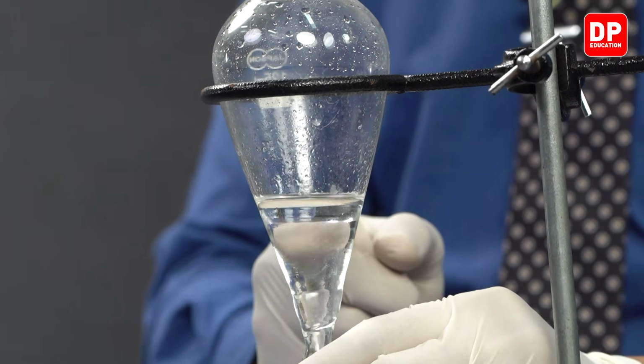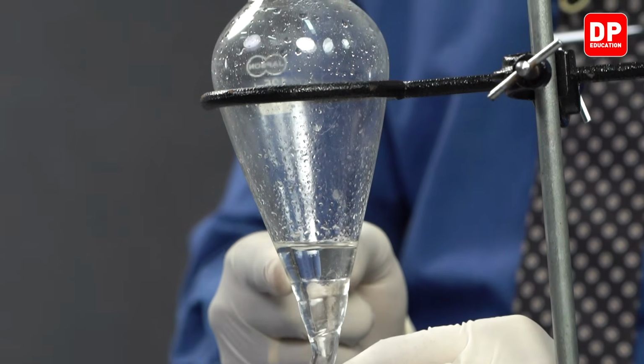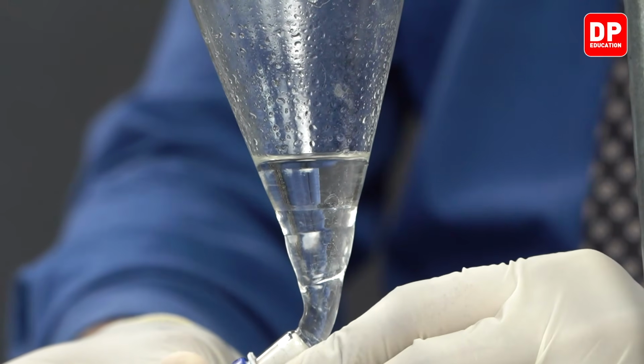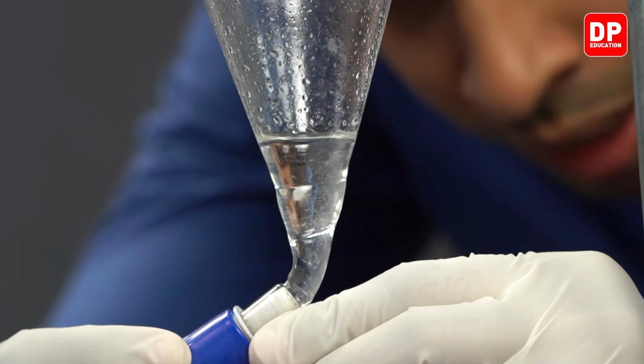As you can see, we can now very clearly see the two layers, the diethyl ether layer on top and the aqueous layer on the bottom. We will separate out the two layers very carefully.